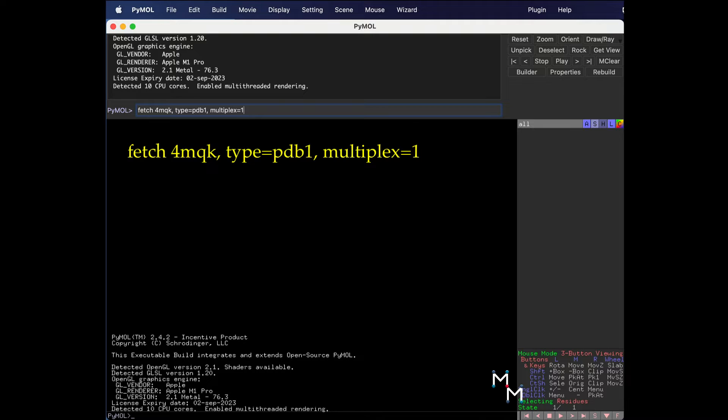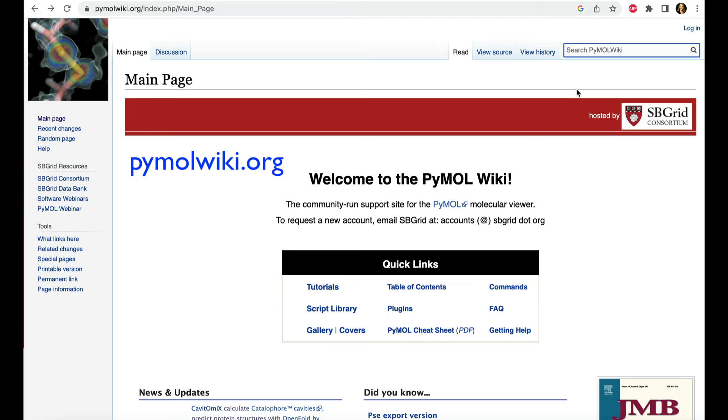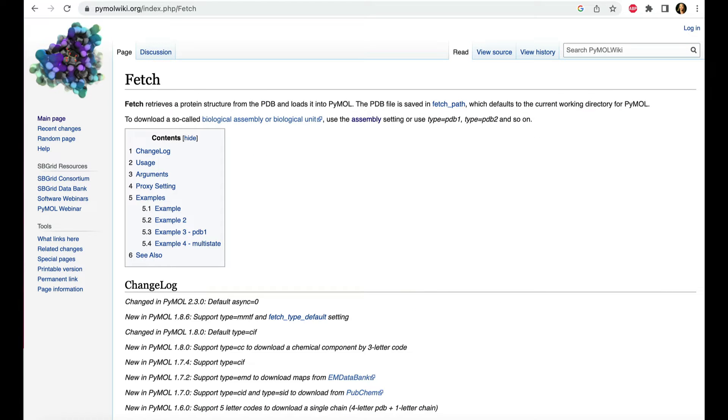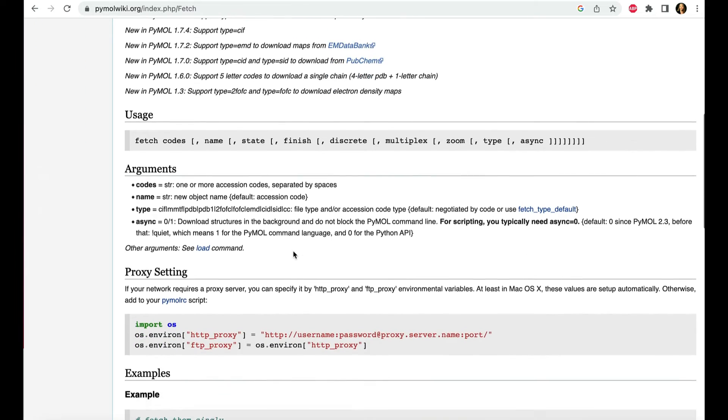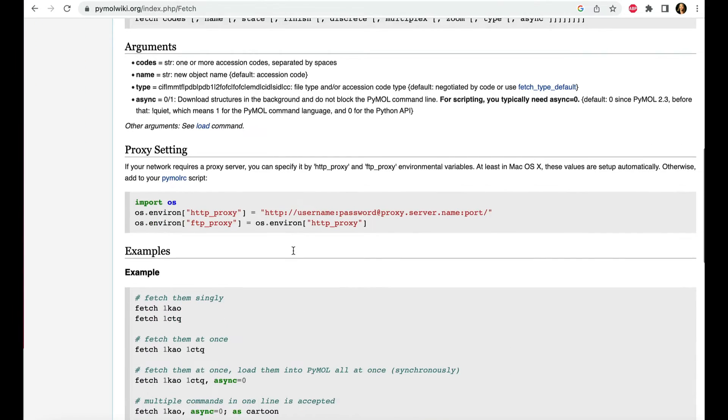If you really want to use the command line to load structures, I'll show a longer code on screen that'll load the biological assembly. I learned this from the PyMole Wiki, your one-stop shop for powerful command line codes that'll help you do lots of cool stuff with PyMole.